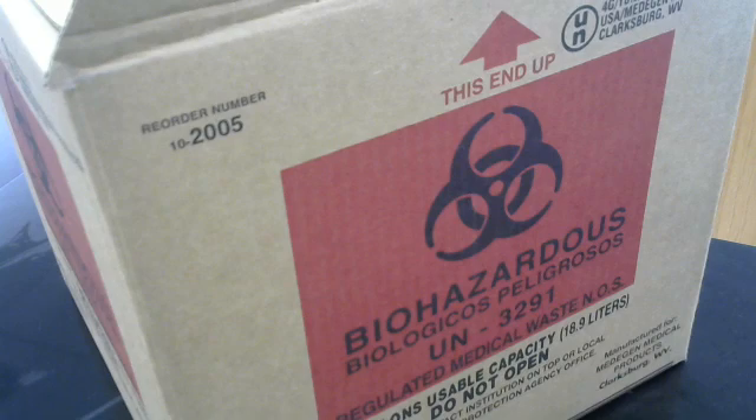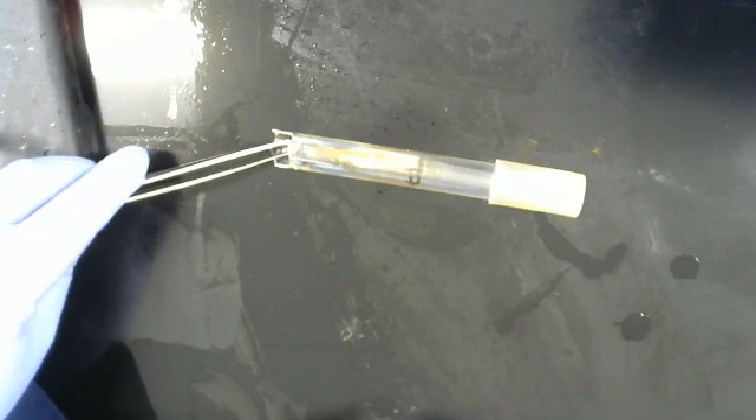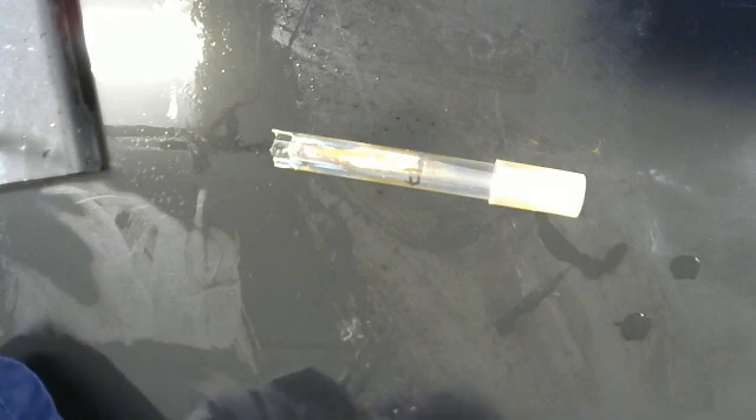Now then, an example. This here is a broken test tube, and it has something in it — we don't know what — so we're going to assume that it's contaminated.